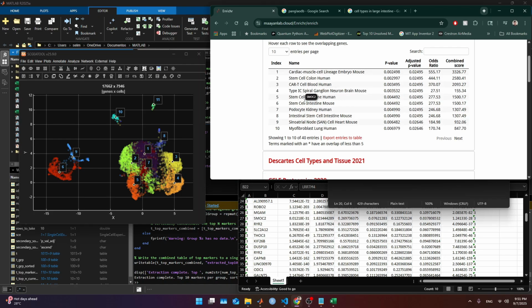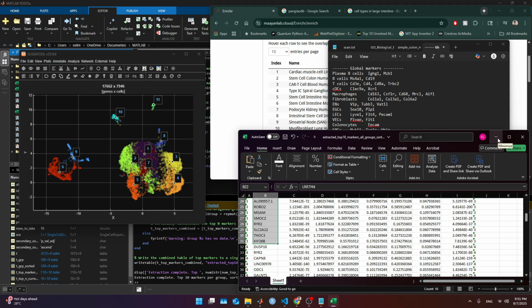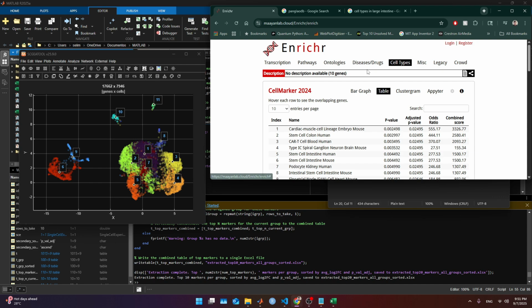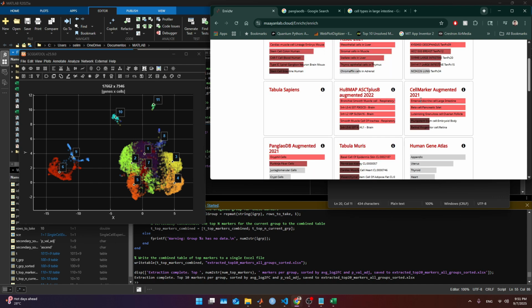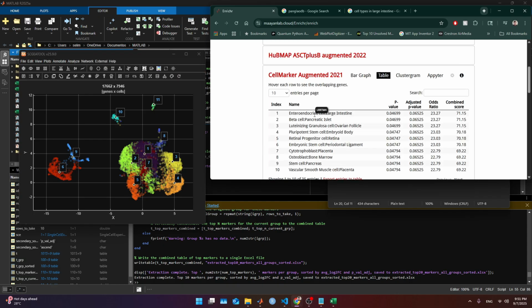Stem cell SMOC2. It tells SMOC2. That's something, but probably we gotta look deeper into what other type of stem cell could be in there. But like this, we can start building the markers. So I'm gonna go back to cell types and see if something cool. Enteroendocrine, that's possible. What the markers are. Okay, that LRRTM4. Stem cell pancreas, we are not interested in that.